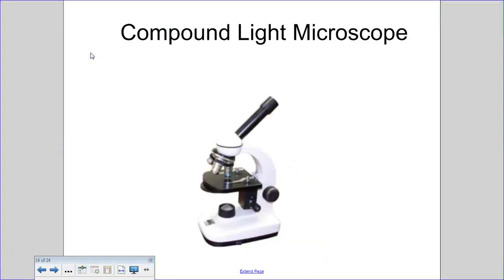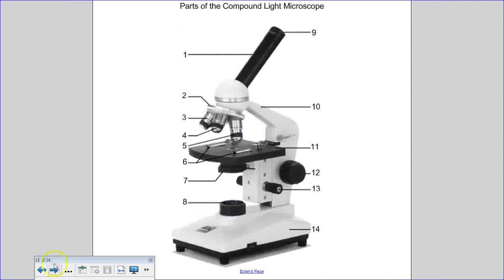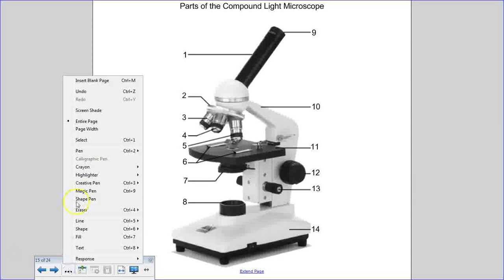So this is the second video lesson on the microscope. First one talked a little bit about development of the microscope and then types of microscopes. This one's going to focus on the compound microscope and a bit about its use, because that's the one we'll be using when we do labs. So you were supposed to go through and identify the parts and functions of the microscope, and this will be better whenever we can do it in class, but I'll go through it here anyway.